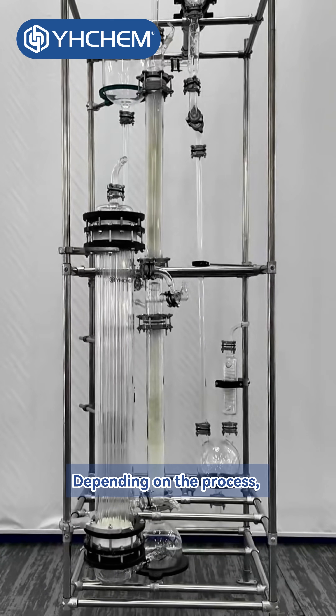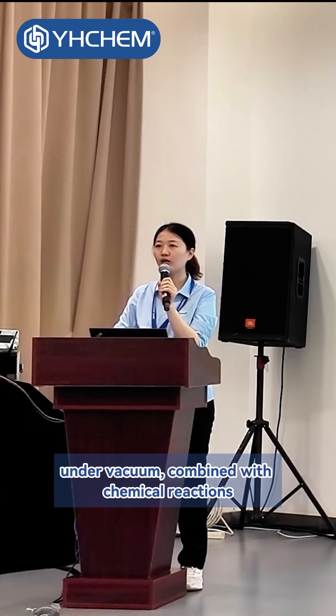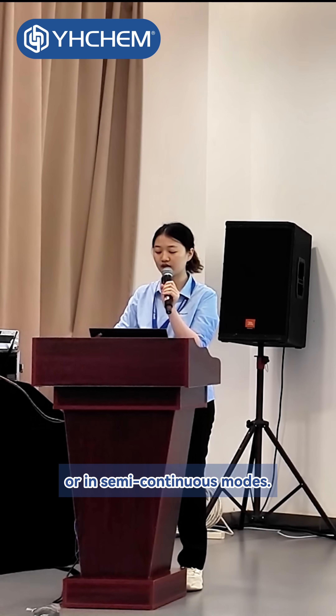Depending on the process, distillation can also be operated continuously under vacuum, combined with chemical reactions, or in semi-continuous modes.